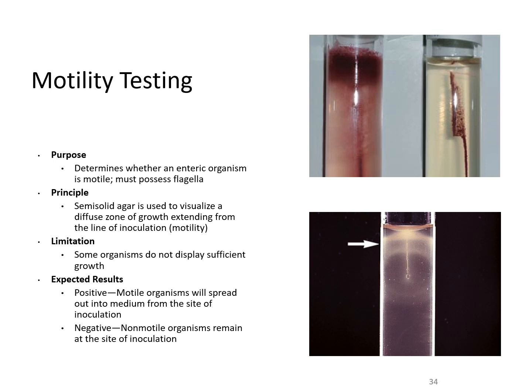So with that agar, we would take that culture onto a needle, which is basically a piece of straight metal, and then we stab that down into that agar, and you can see here where that organism has grown all along that stab. And then what we're looking for is, if it has motility, then that organism is able to diffuse throughout that agar. So you can see here at the top where you have growth within that agar outside of that slant. You can see the growth coming out here.